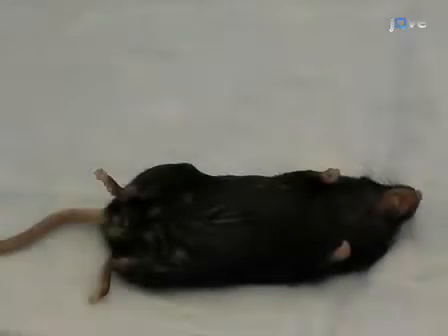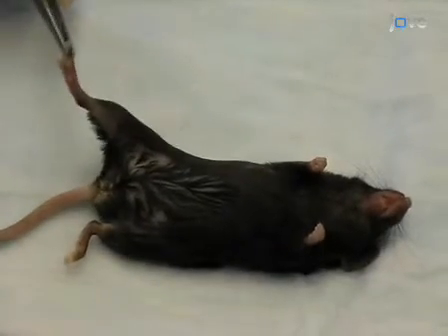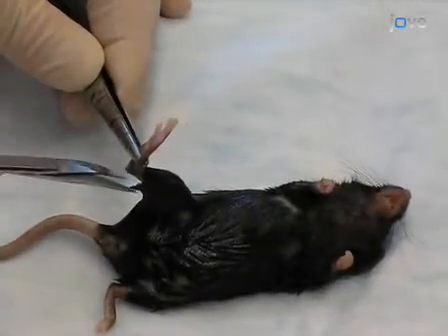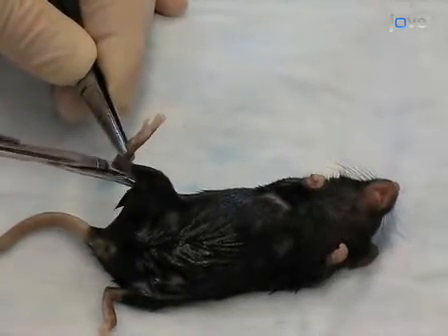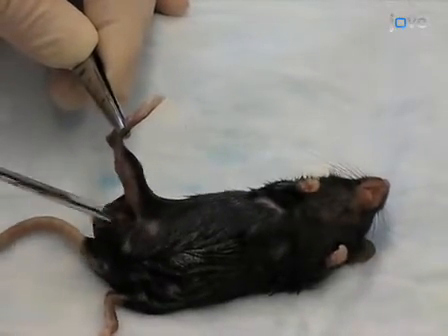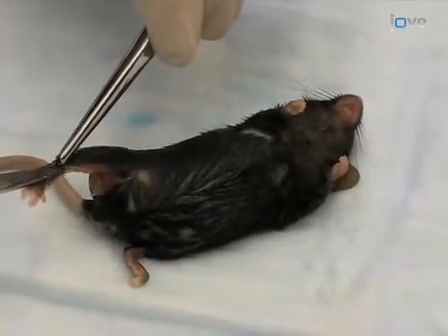After euthanizing the donor mouse, prepare the legs for incision by spraying them with 70 percent ethanol. Firmly grasp the mouse's ankle using blunt forceps and use sharp scissors to carefully cut away the skin and muscle tissue of the legs. Begin at the Achilles tendon to remove the skin from the posterior portion of the leg, being careful not to damage the bone. Next, clip away the skin and muscle from the anterior portions of the leg.